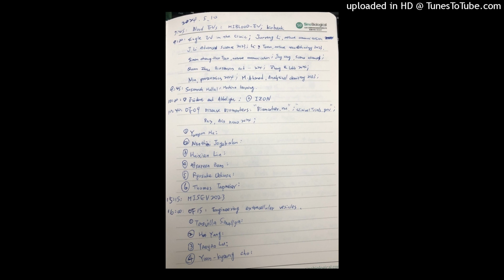EVs were isolated according to the standard differential centrifugation method. Then, it was confirmed that EVs were properly collected by nanoparticle tracking analysis and cryogenic electron microscopy.